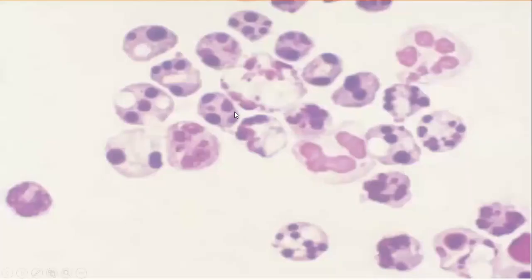So these are actually the typical yellowish appearance of your needles. Notice the needle appearance of your monosodium urate crystals. This is a neutrophil seen with CPPD crystal intracellularly.